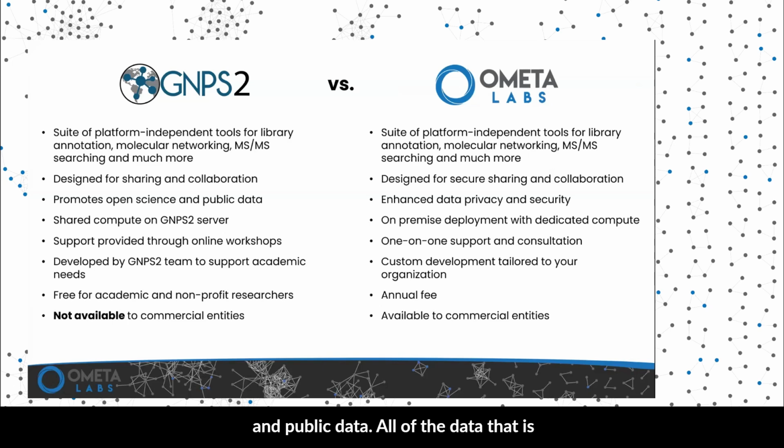All of the data that is run on GNPS is housed on a shared server and is run using shared compute. There is a lot of support provided for GNPS users through online workshops like this one, as well as a lot of other online workshops as well.